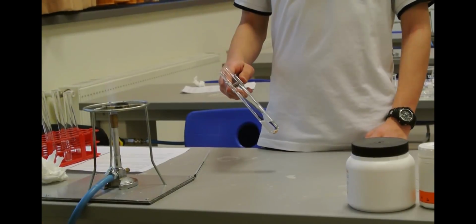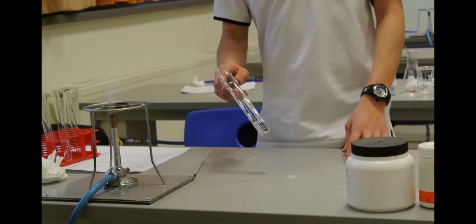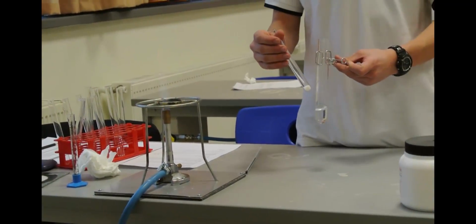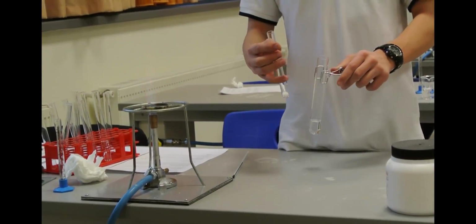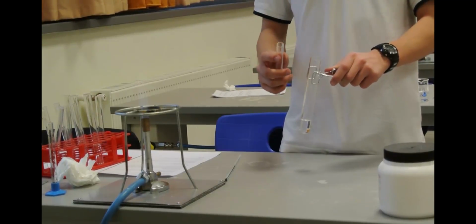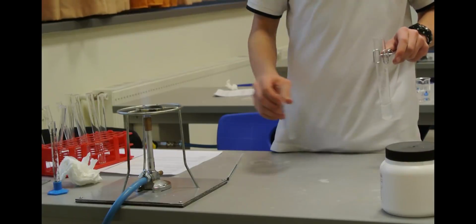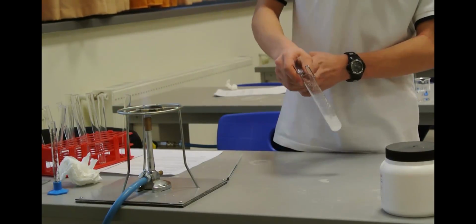Okay, so now I have another 10 milliliters of hydrogen peroxide, and I will do the same. I will add around 4 spatula measures of sodium potassium tartrate to it, and I will shake it until it dissolves.